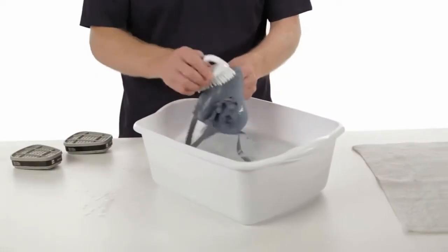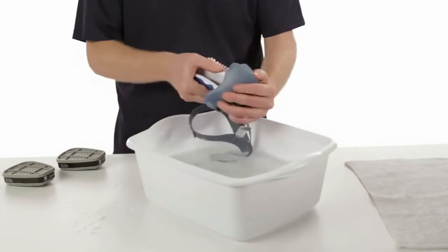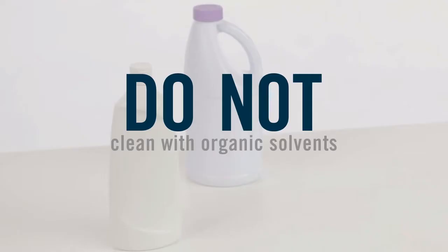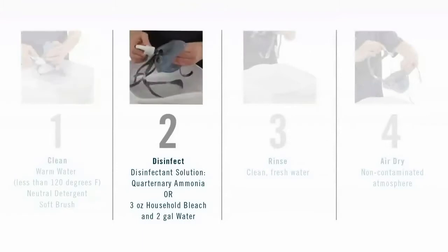Clean the facepiece between uses by removing cartridges and filters and immersing in warm cleaning solution. Do not clean with organic solvents, which may degrade some respirator components. Make sure the water temperature does not exceed 120 degrees Fahrenheit. Scrub with a soft brush until clean. Add neutral detergent if necessary. Do not use cleaner containing lanolin or other oils.